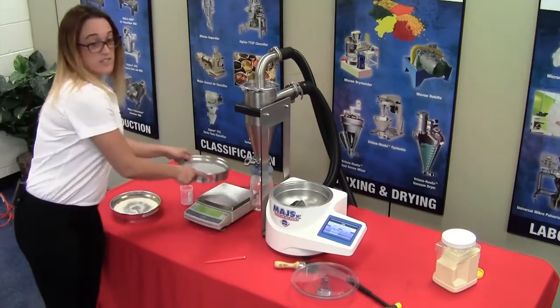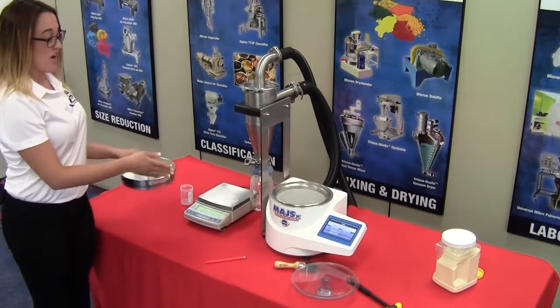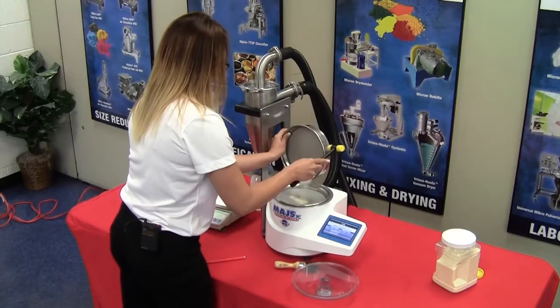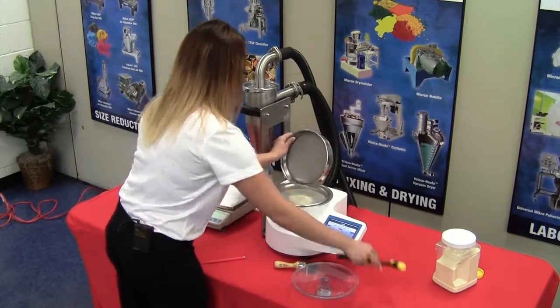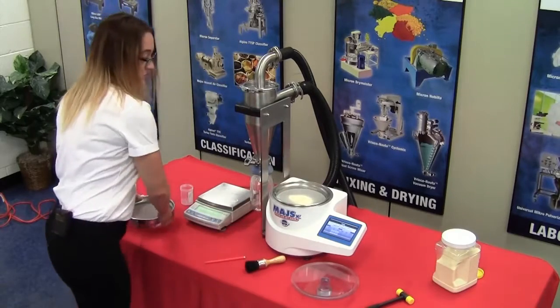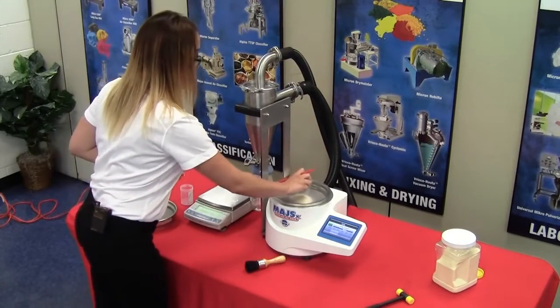We're going to place the sieve screen onto the airjet sieve itself, and we're going to transfer the retained sample onto this screen. And then we're going to press next. We're going to place the lid back on the airjet sieve, and we're going to press start.